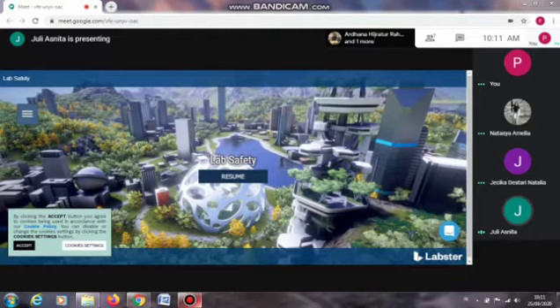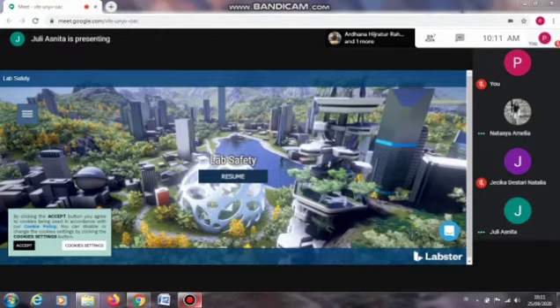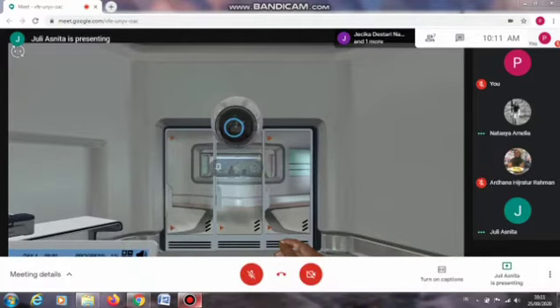Sebentar ya. Udah nampak? Udah. Udah, Juli. Oke. Klik.